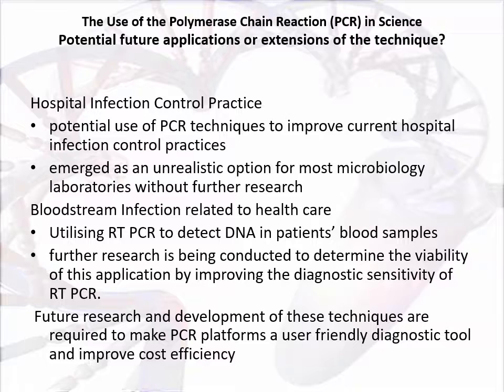The potential future applications or extensions of the PCR technique. Research into the potential use of PCR techniques has been improving over the years, and in one aspect we look at the improving of the current hospital infection control practices, which have been trialled utilising the multiplex polymerase chain reaction to confirm if several aspects of the enteropathogens are prevalent in stool samples of the patients.